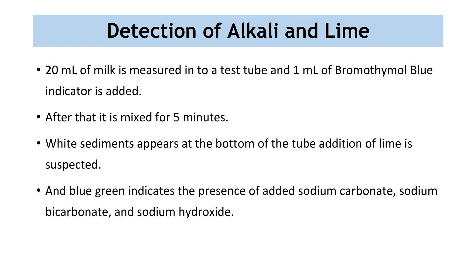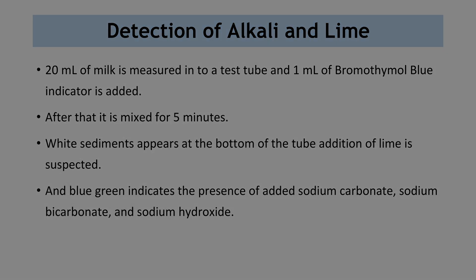Now let's see how to detect alkali and lime. 20 ml of milk is measured into a test tube and 1 ml of bromothymol blue indicator is added. After that, it is mixed for 5 minutes. White sediments appearing at the bottom of the tube indicates addition of lime is suspected. Blue-green color indicates the presence of added sodium carbonate, sodium bicarbonate, and sodium hydroxide.